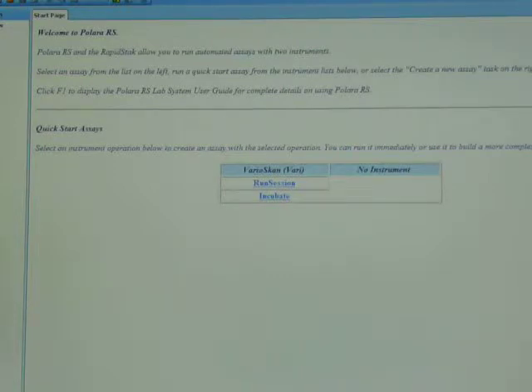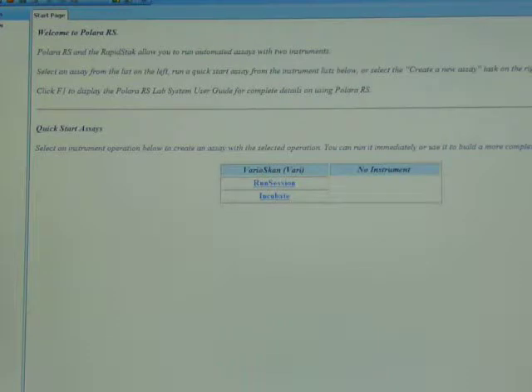Here you'll see the welcome page of Polara RS. You can see in the center of the screen that we have the driver for the VarioScan flash installed.